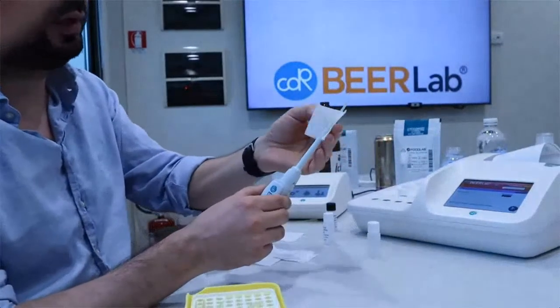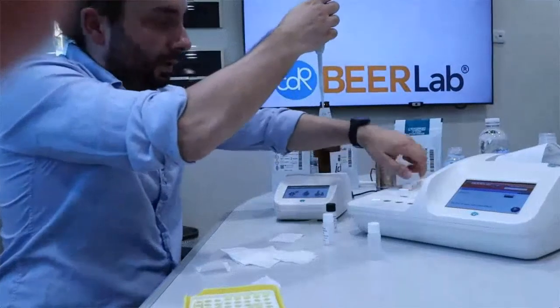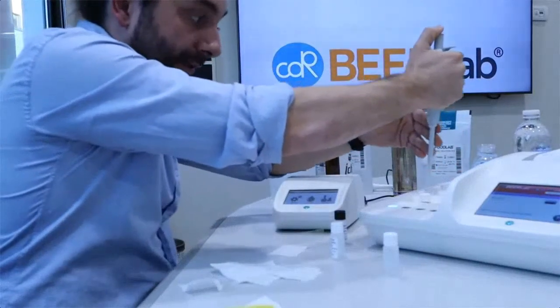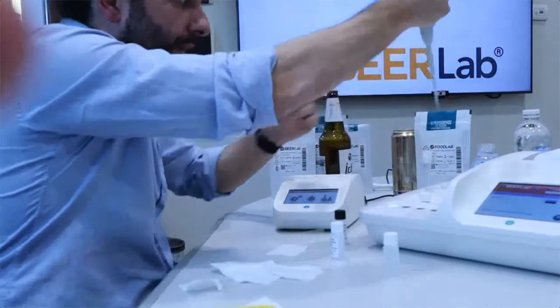Here, same story. We have to wipe the tip, and we open the cuvette. We put the tip into the liquid, and we press a few times all the way down. That's it.